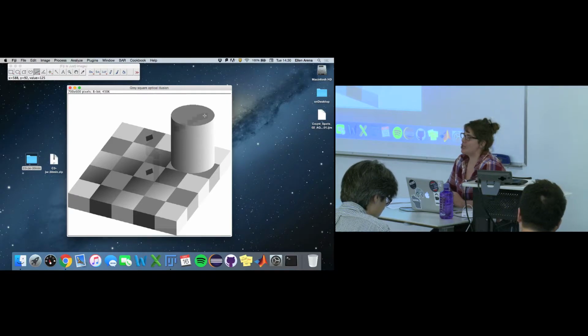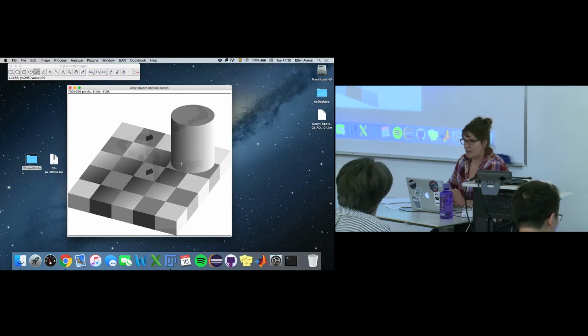I mean, obviously I'm trying to trick you, but so are your eyes, right? It's not just me. Because of the checker pattern that we see, we assume that the upper square is darker than the bottom one, despite this shadow being cast, right? The thing is, our eyes are taking into context this whole story, right?